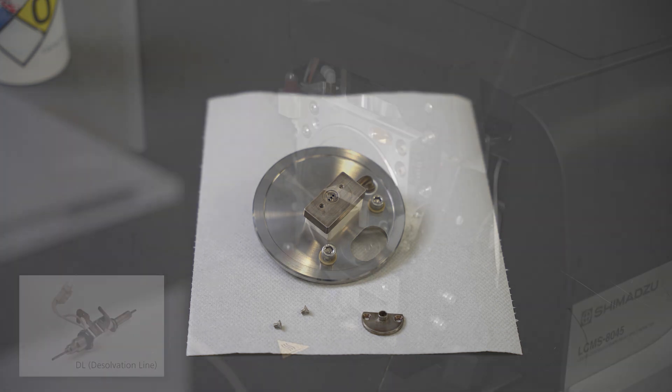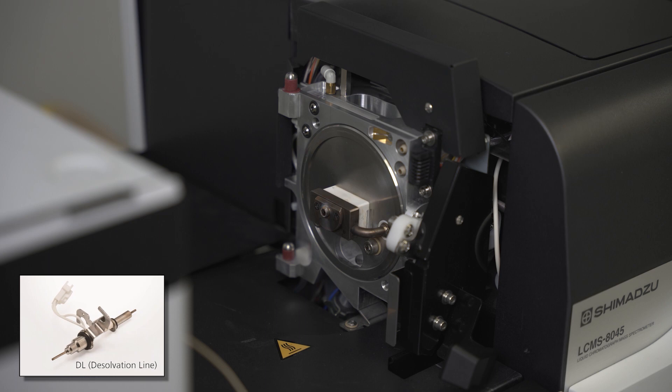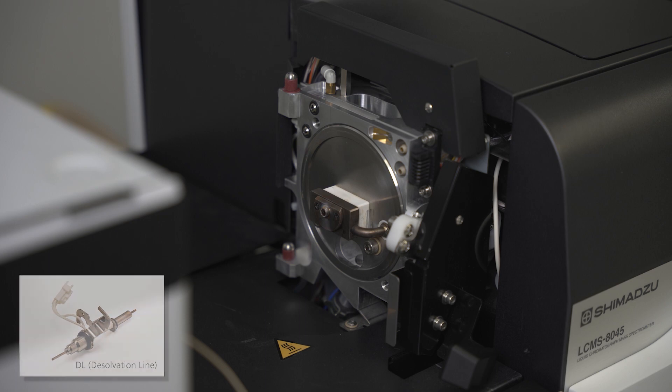Avoid cleaning the tip of the desolvation line, as this can cause a blockage of the tubing. If the tip of the DL is badly soiled, replace the DL.